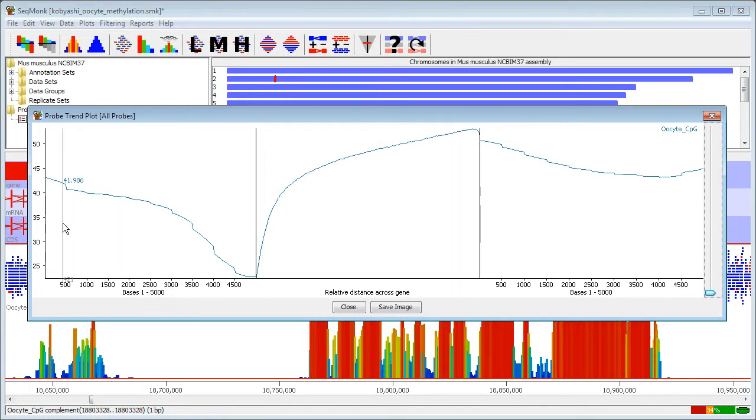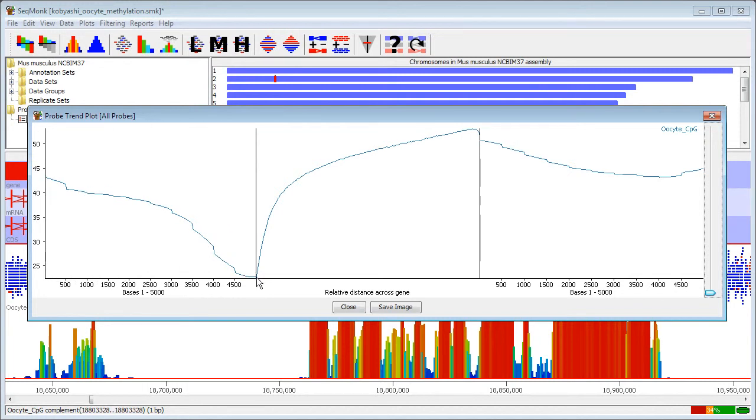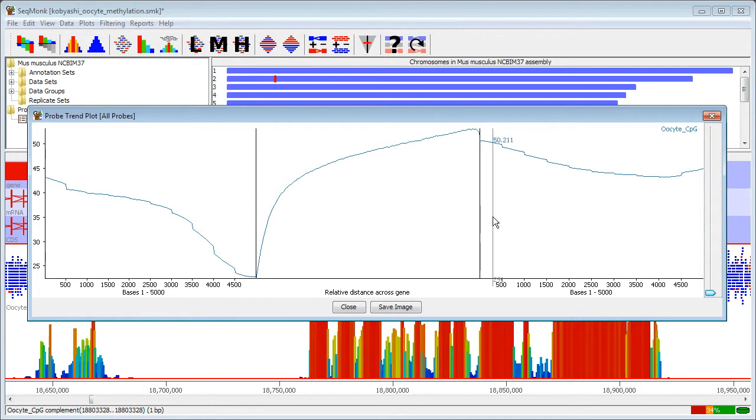This is the 5 kilobases upstream where I can see that there's a loss towards the start of the gene and then afterwards I can see that it's a slightly flatter profile.